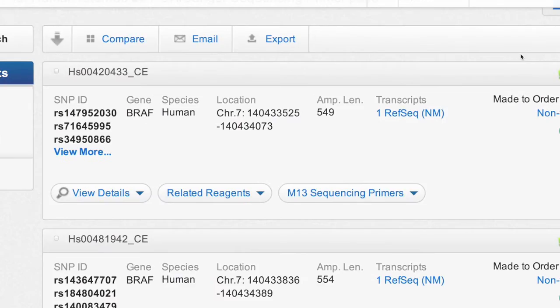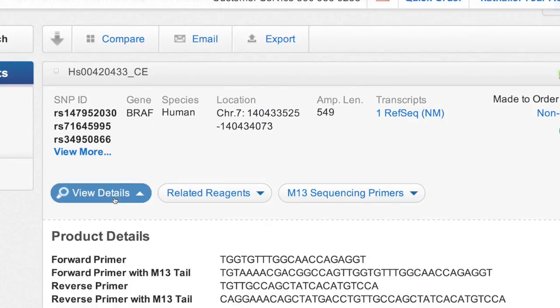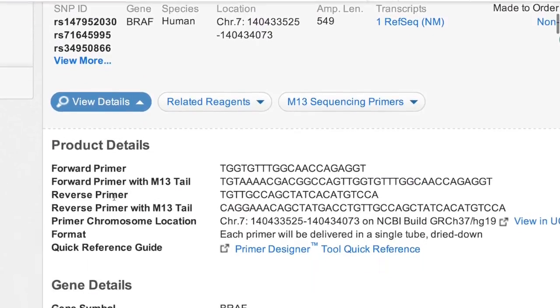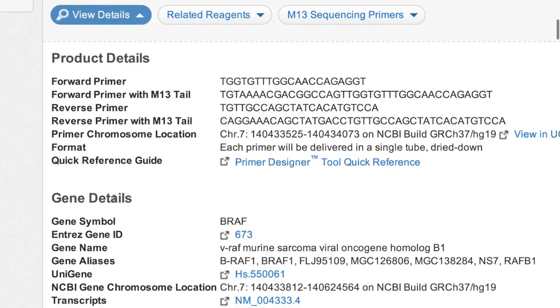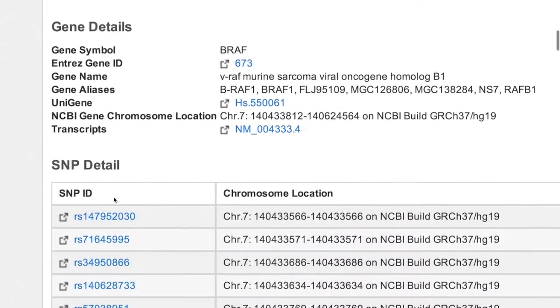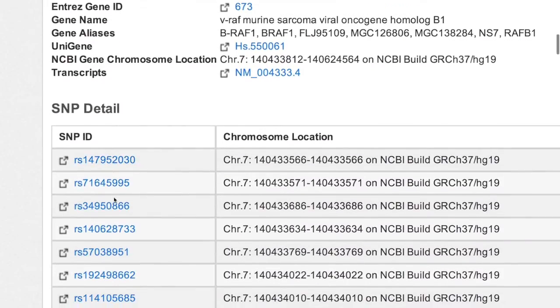The results page shows each set of primer pairs. Click View Details to access all the information related to this first primer pair. If you're logged into the Life Technologies website, the primer pair sequences will be shown. You can also see the list of SNPs detected with this primer pair.